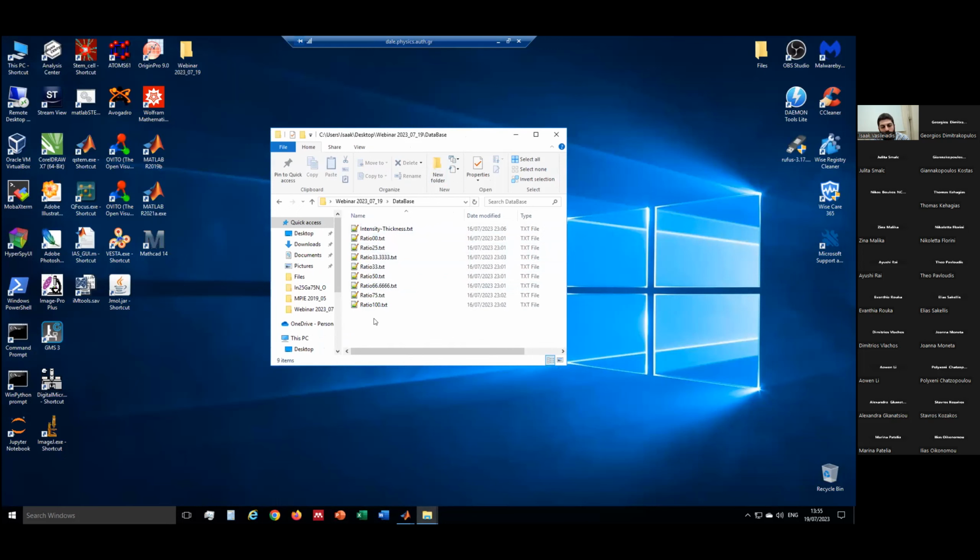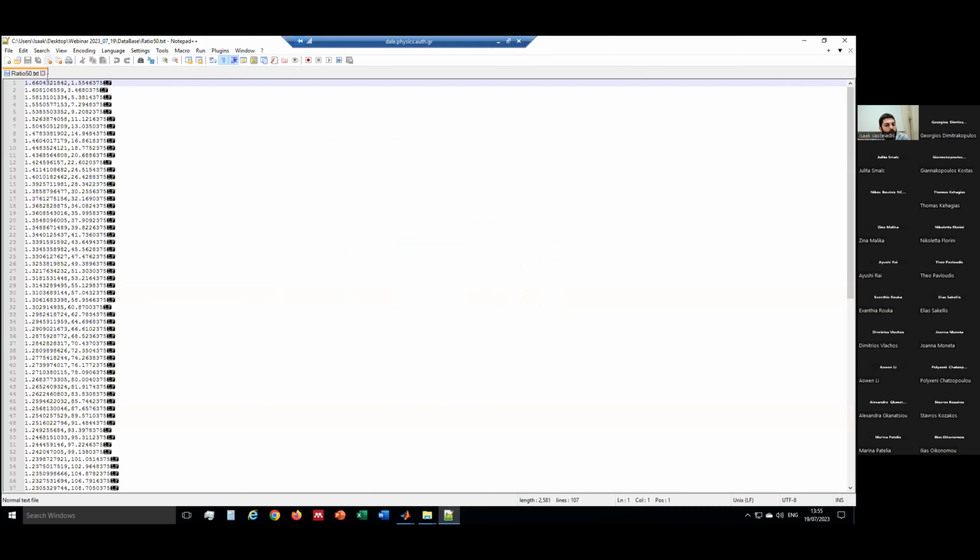The database consists of different txt files with a name, a ratio, and a number. The ratio number refers to the reference composition. So a ratio 50% has the data about the intensity ratio and the composition. If we have a quantum well with thickness 1 monolayer and composition 50%, then we know from simulations that the expected intensity ratio is these values for each image, for its thickness.